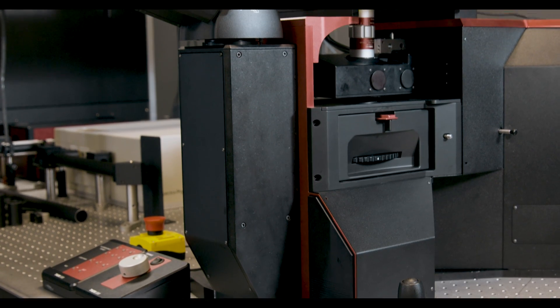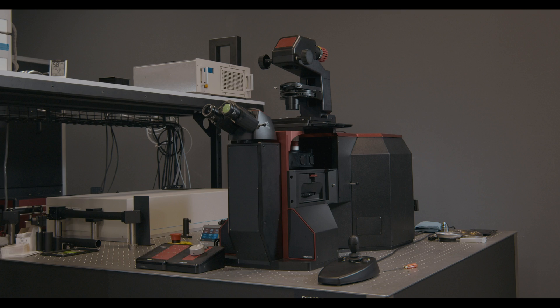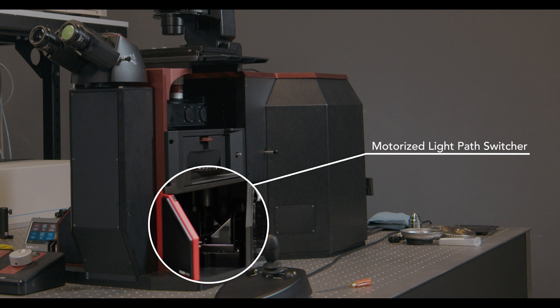We started out with having large field of view — we know that everyone in the future is going to want large field of view optics. Another thing is that in order to perform very advanced imaging techniques like two-photon microscopy, you want certain turnkey features like the ability to switch between different imaging modalities from wide field to two-photon microscopy, and with that you need a motorized light path switcher. So we automatically added that as one of the design features.